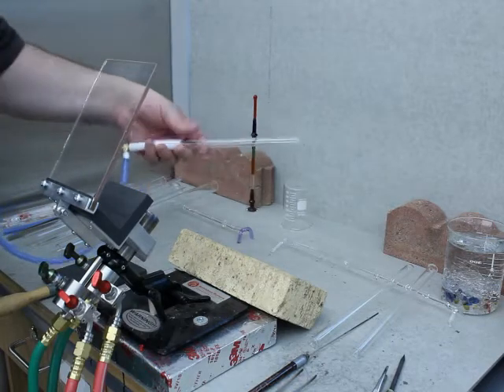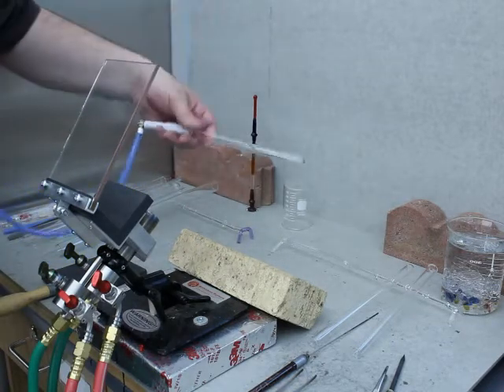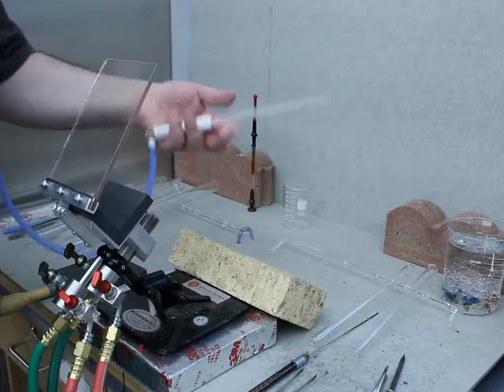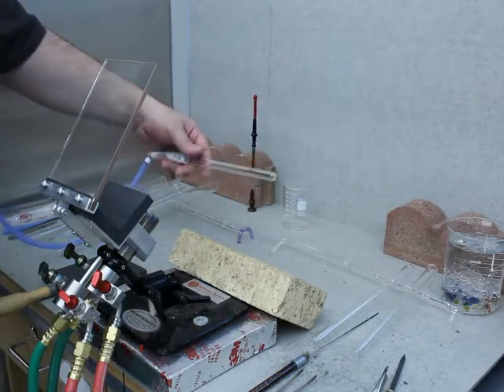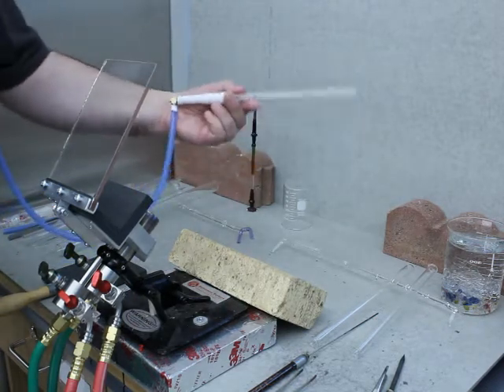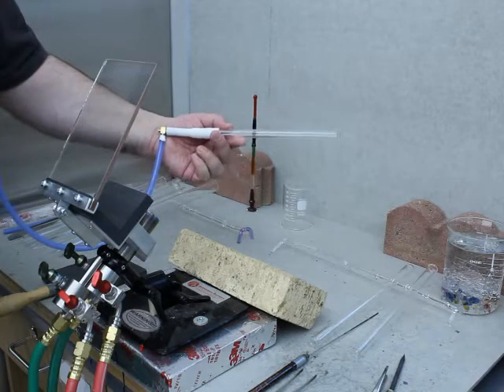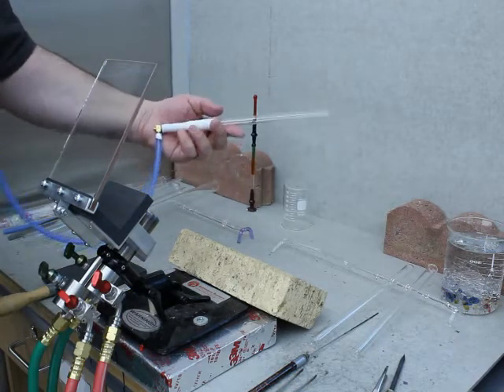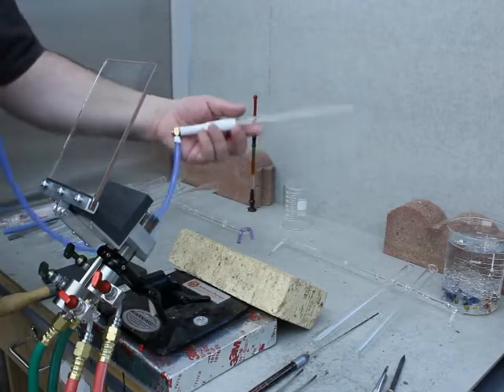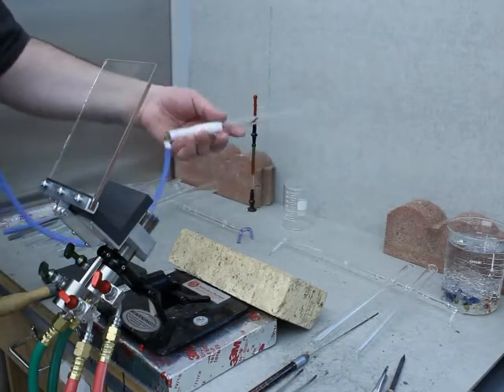My students are getting ready to learn the fundamentals of using a blow hose for scientific glassblowing, so I wanted to make this video just to briefly show the equipment that you need, because if you want to do scientific glassblowing, you're going to need a simple blow hose setup.